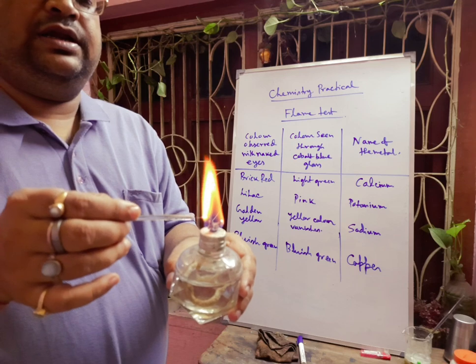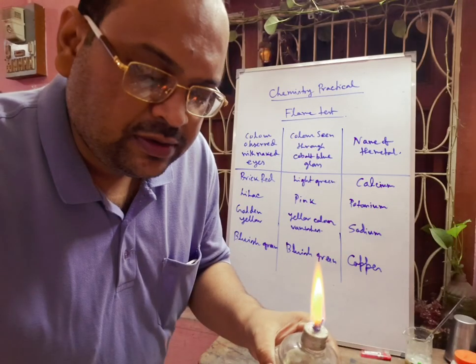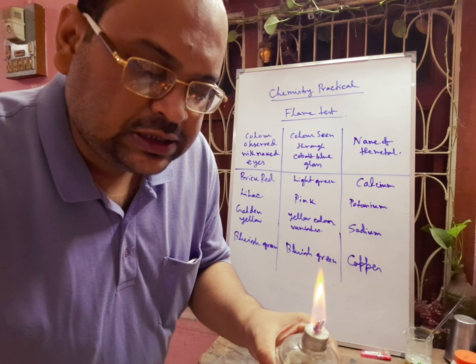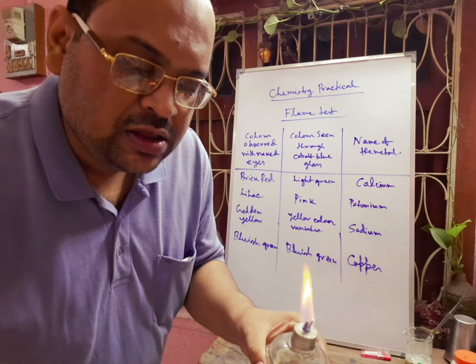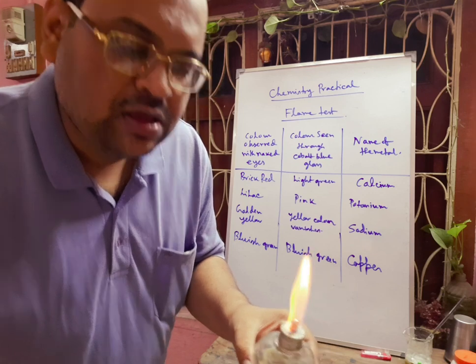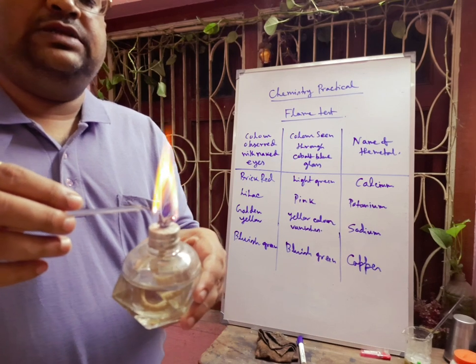Here you see a greenish flame. We will do the test again. This greenish flame indicates that copper is present. Again, a greenish flame is coming.